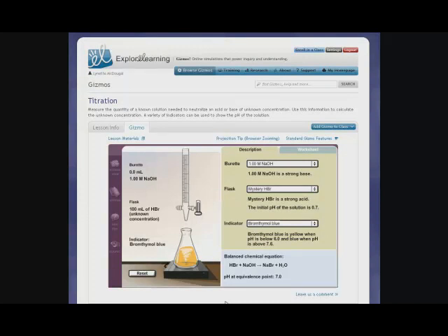This simulation is referred to as a gizmo, and it comes from Explore eLearning. This gizmo is an acid-base titration.